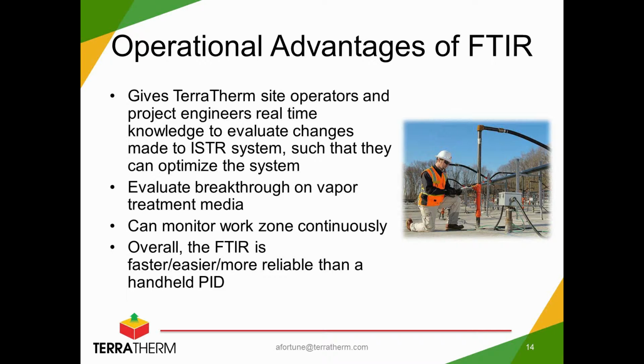And there was definitely less influence or issue with humidity. I know that's a challenge at many of our sites with the PID monitoring, is the effect of humidity on that piece of instrumentation. The FTIR was much better able to handle that.